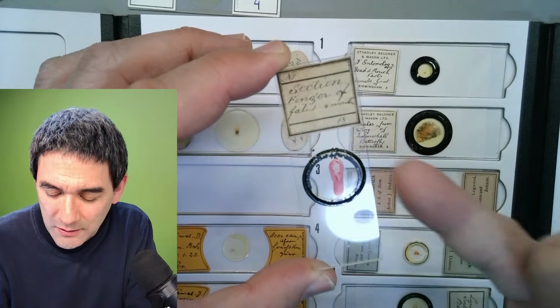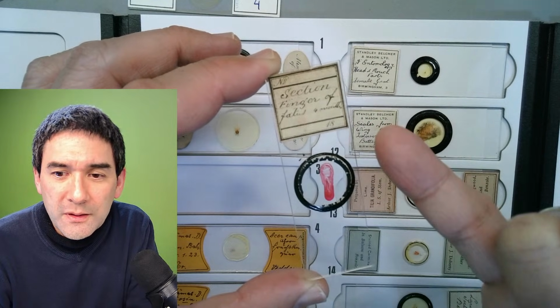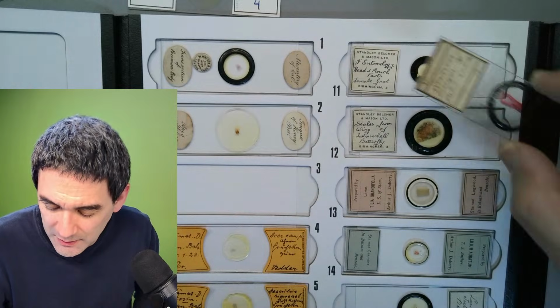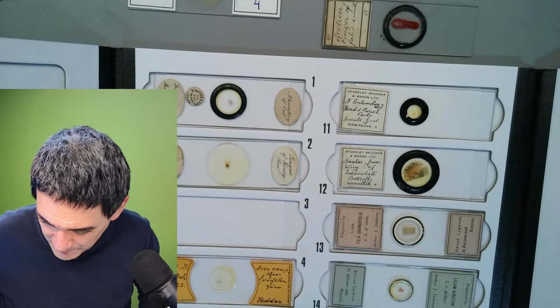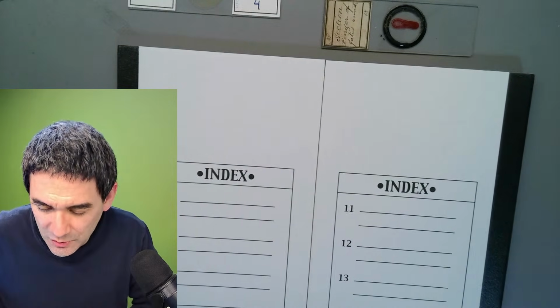Look at this here. The date is not complete, but it says 1800. So these are from all of those here. One of the more unique ones. However, I've got several others that look extremely pretty. So if you want, you can quickly have a look at those two as well.